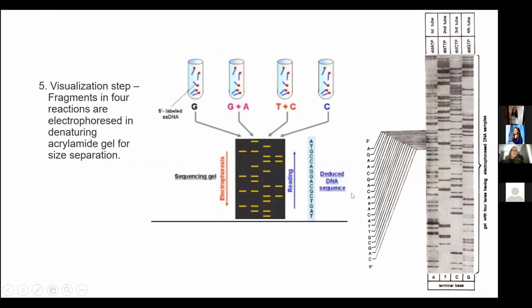Next is the visualization step, similar to before, and it's also done by electrophoresis, on an acrylamide gel. So similar to before, we can then conclude our final sequence by looking at these different sized fragments that we obtained.